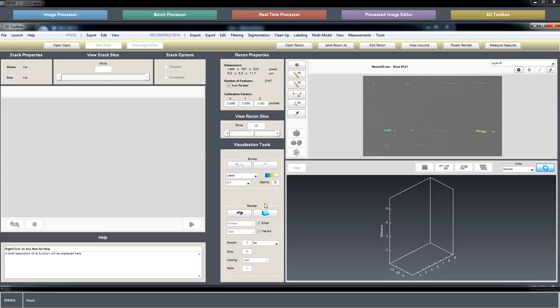Like a FEA type, yeah, finite element, FEM. Not at the moment. The best I could do is say export, I'm not sure what kind of data it can handle. It'll probably be a little slow, but you could visualize and make a surface rendering of all of the features, and then this export surface menu would light up, and you'd be able to export that surface into an STL format. And Abaqus might then be able to make a volumetric mesh of that STL surface.